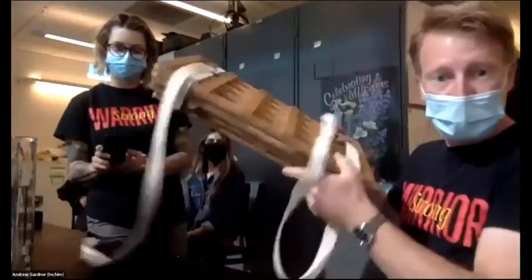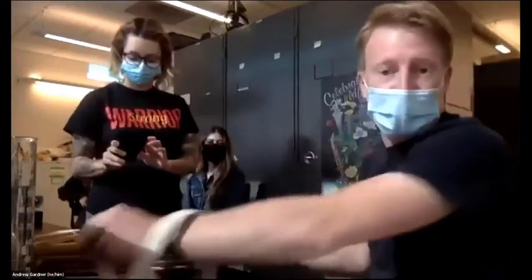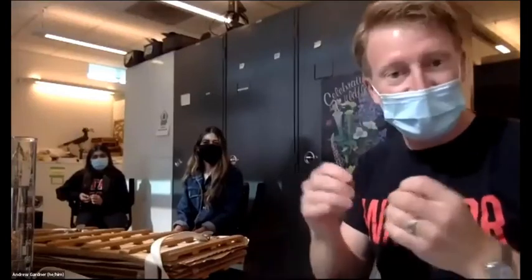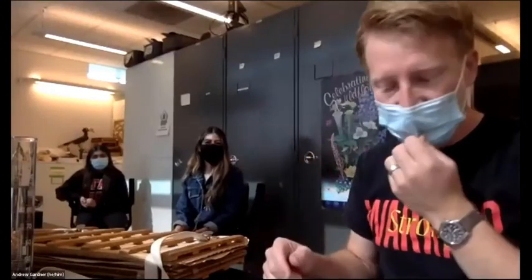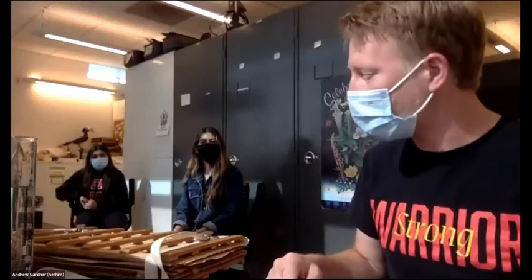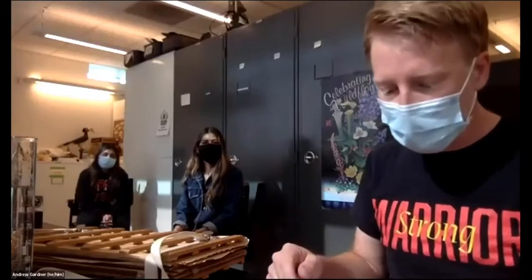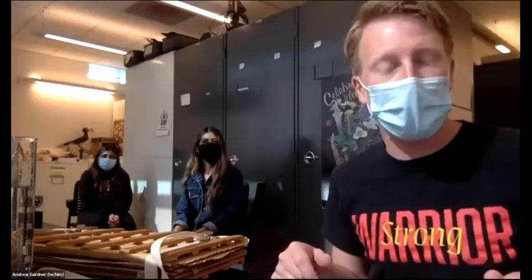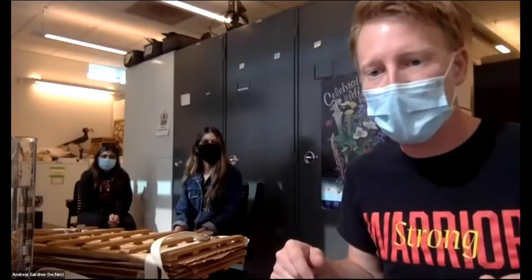Just like that. Now your plant is slowly being converted to two-dimensional, and also slowly the water is coming out of it. And if you set that in the sun, the water can come out of it more quickly and it'll dry even faster. So as I mentioned earlier, you can do that with books as well. And that's the very simple way that we make plant specimens.